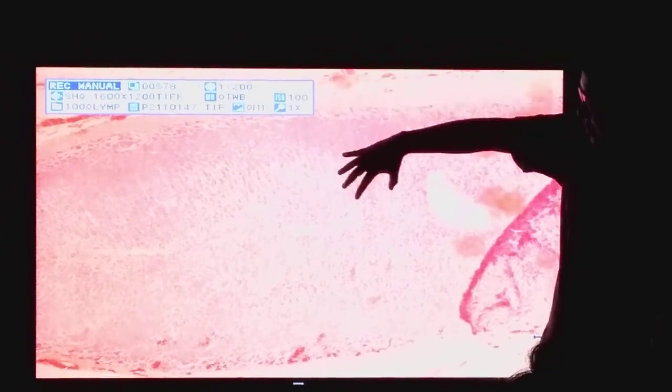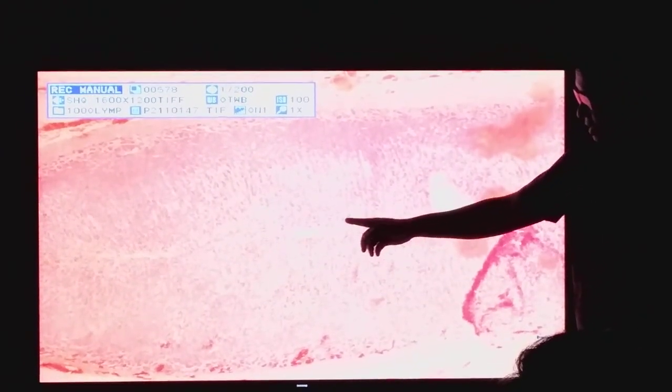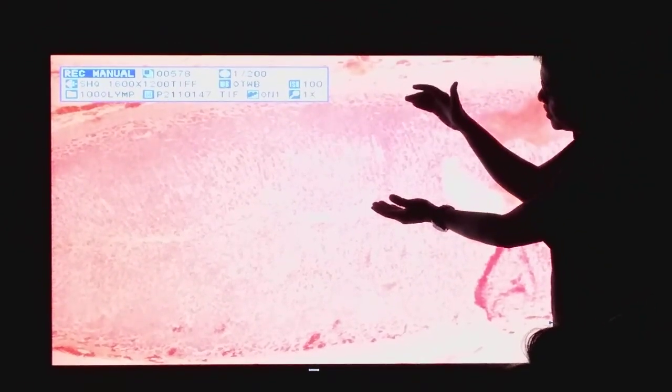That should be your identifying point for medulla: presence of large blood vessels. Now, the cortex is divided into three functional layers. These three layers are not distinctly separated from each other. They differ in function only. They are separated by function and not by their morphology, or they can also be identified based on their location.